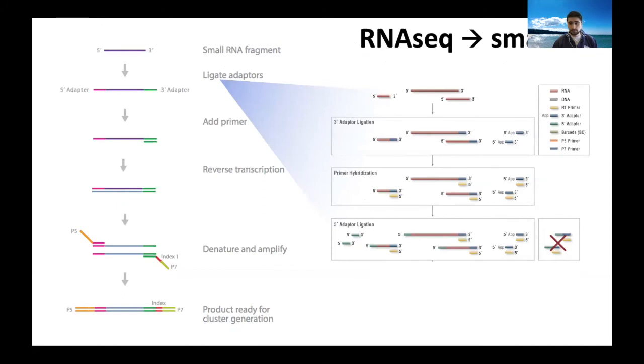All right, so a couple of slides on small RNA, and then we're almost done with the RNA part. So the small RNA, the main difference is that we are starting with a very small fragment.